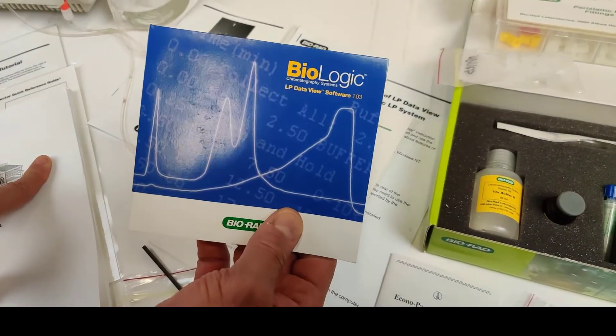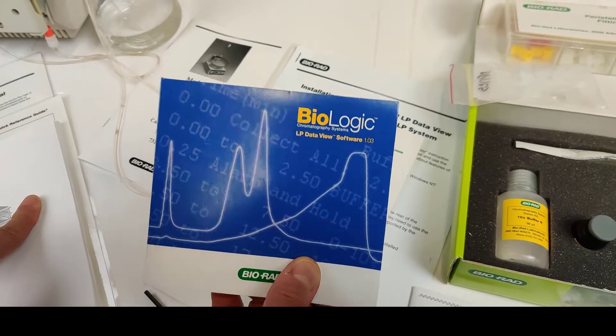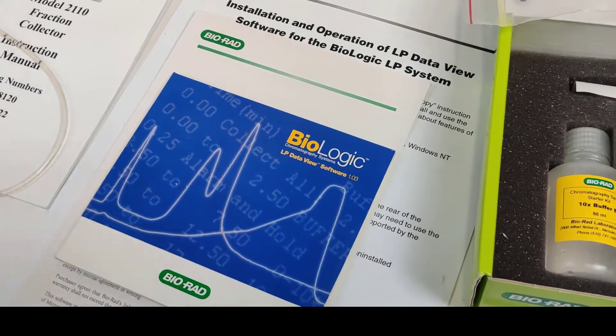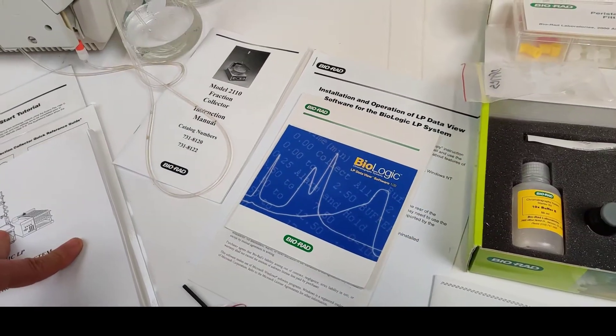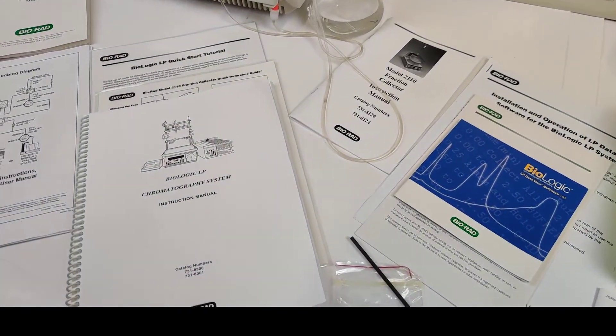The system comes with the BioLogic LP data view software. That's basically the software that will collect the data on your computer and will sort the graphs of the output — different outputs, as you have seen in the pictures shown.